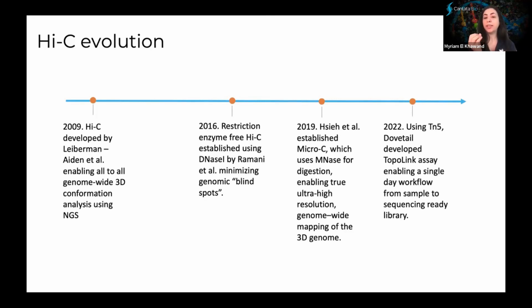So Micro-C, which uses MNase, opened up the highest achievable resolution of all the Hi-C flavors out there. What all of these Hi-C workflows have in common is that they usually take around 2 to 3 days or longer to actually complete.